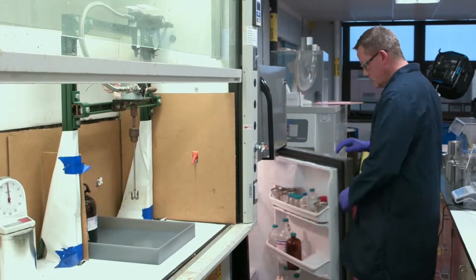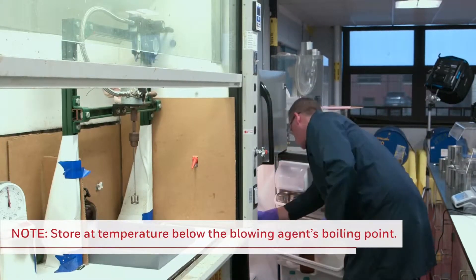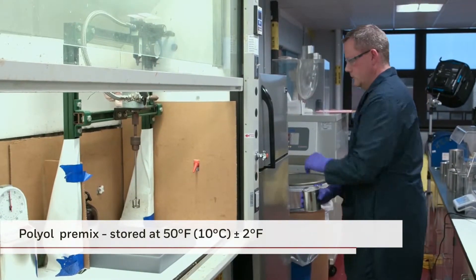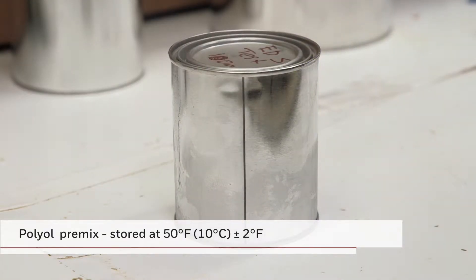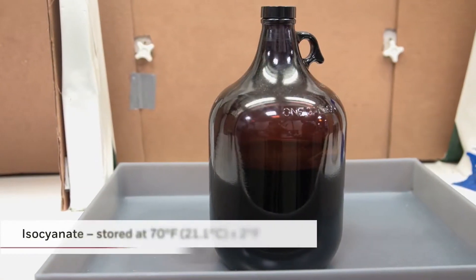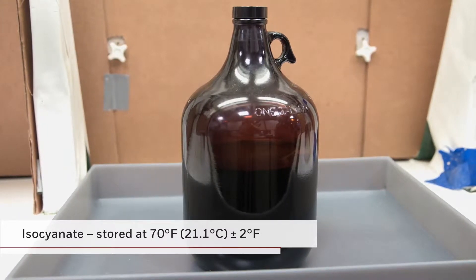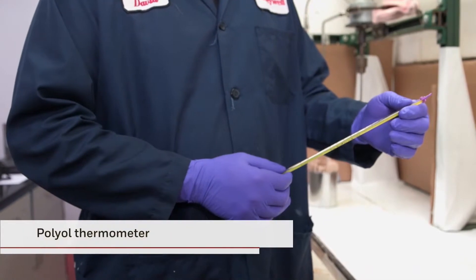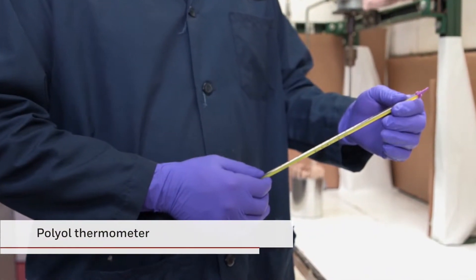The polyol premix is prepared and then stored at a temperature which should be below the boiling point of the blowing agent. In this video, our polyol premix was stored at 50 degrees Fahrenheit, plus or minus 2 degrees, or 10 degrees Celsius. The isocyanate is kept at a room temperature of 70 degrees Fahrenheit, plus or minus 2 degrees Fahrenheit, or 21.1 degrees Celsius. A polyol thermometer will be used to ensure that the polyol premix is at the proper temperature prior to mixing.